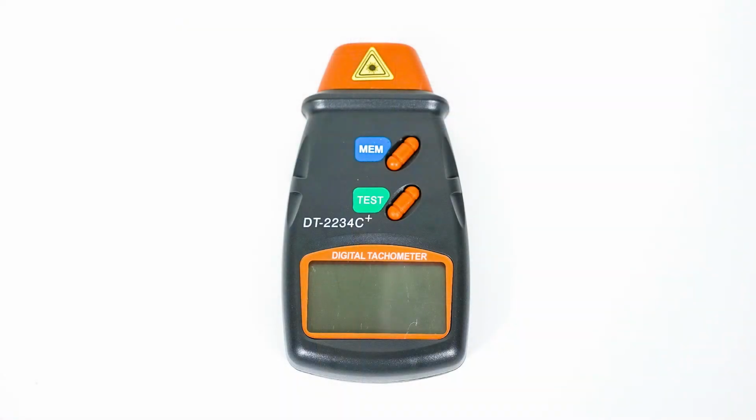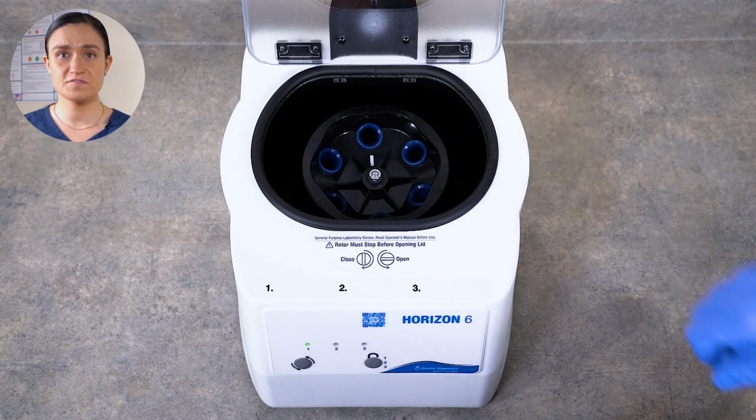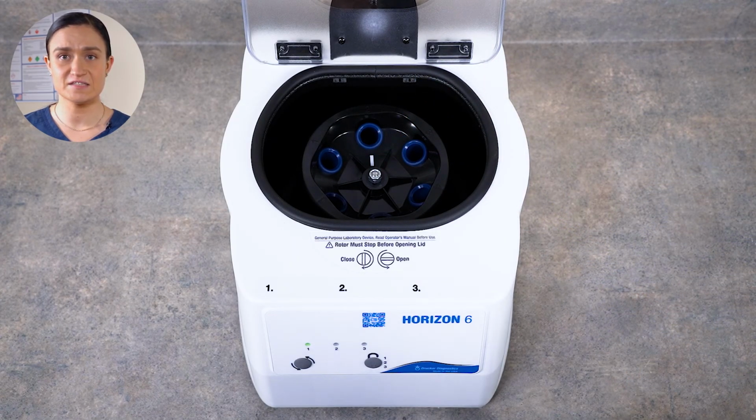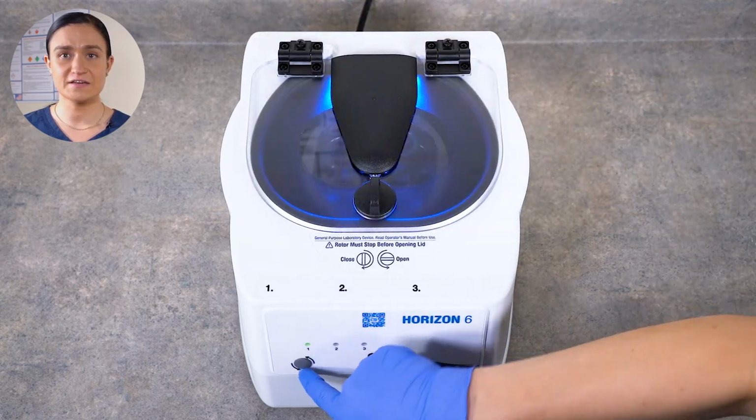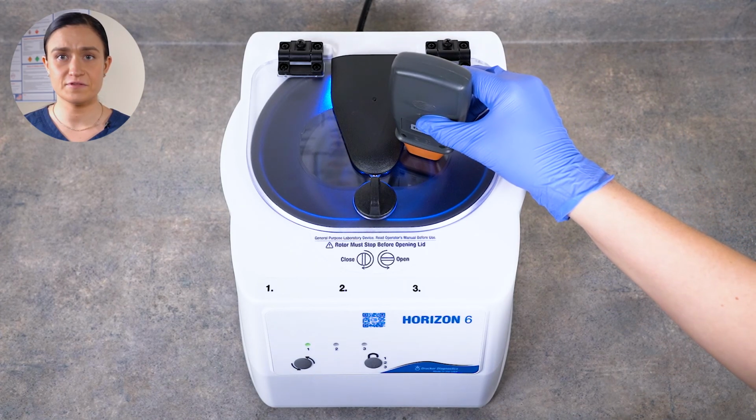Your Horizon 6 does not require any regular maintenance, but you may wish to confirm the spin speed. To do that, you'll need a phototachometer like the one shown here. Your rotor has a reflective strip on it, so the phototachometer can easily detect the speed. Just start the cycle you wish to test, wait a minute or two for it to reach its peak speed, and point your phototachometer down through the clear lid. You'll quickly get a reading.